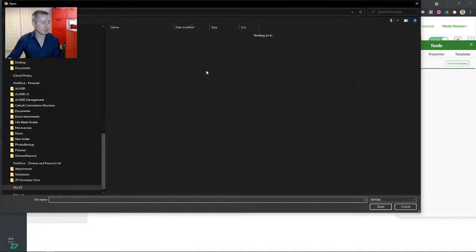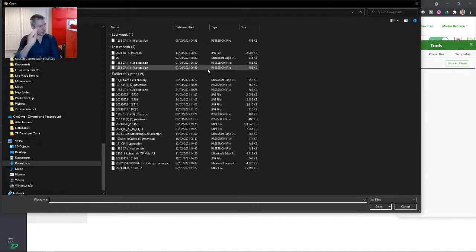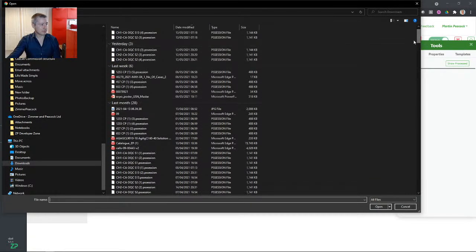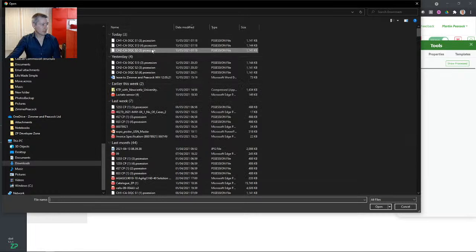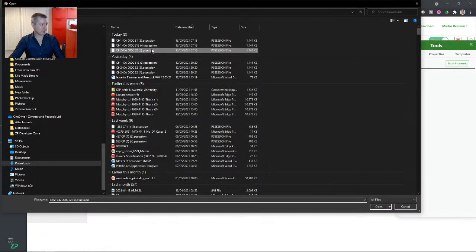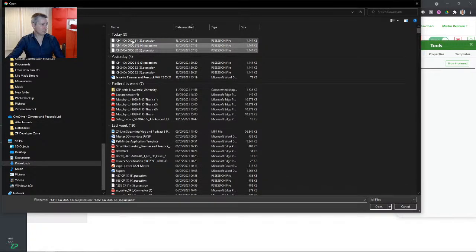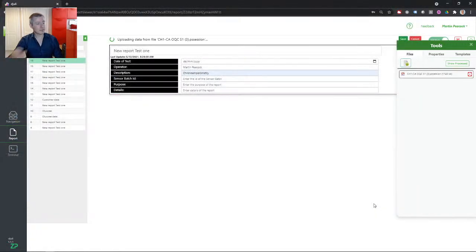You gather the data on your laboratory computer and your laboratory instrument. You upload the data to Julie. I'm just going to upload some data now. So that data is just uploading now. So it's pretty easy. So I'm uploading some chronoamperometry data. This is really what we did with the fructose sensor.